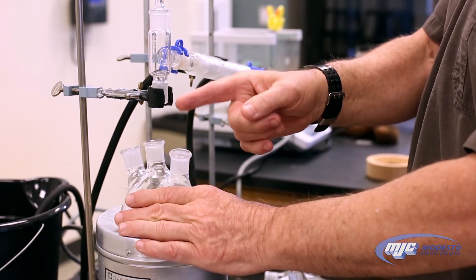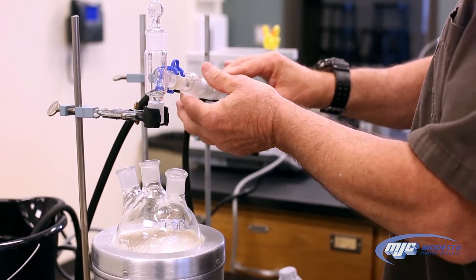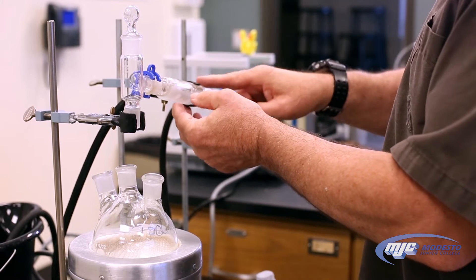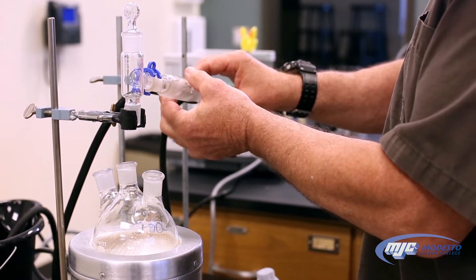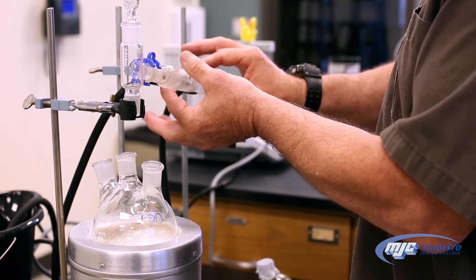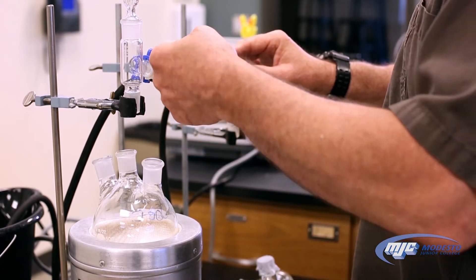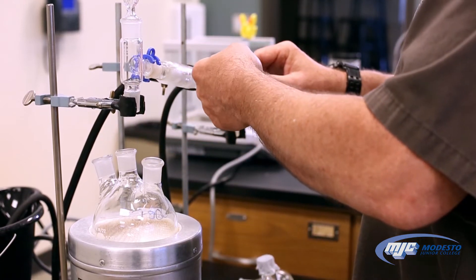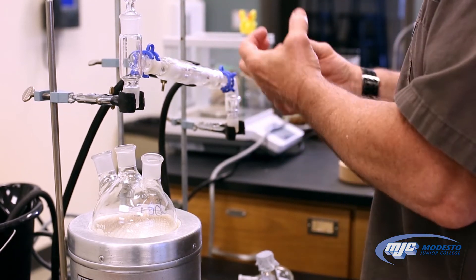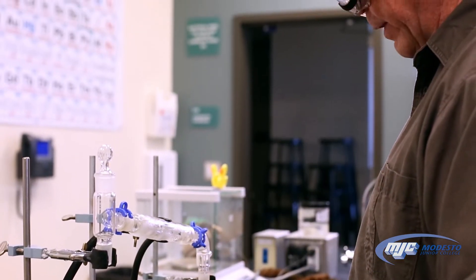So what we're going to do is heat this up, the water will evaporate. As it comes through here, this is called a jacketed condenser. We have some cold ice water running through this jacketed condenser. There's an inside glass tube and this outer glass tube, and the water is between the two. The vapor is going to come up through the middle of the inside tube, and when it hits that cold tube, it's going to condense and become liquid again. We're going to collect that over here in our 100 milliliter round bottom flask.